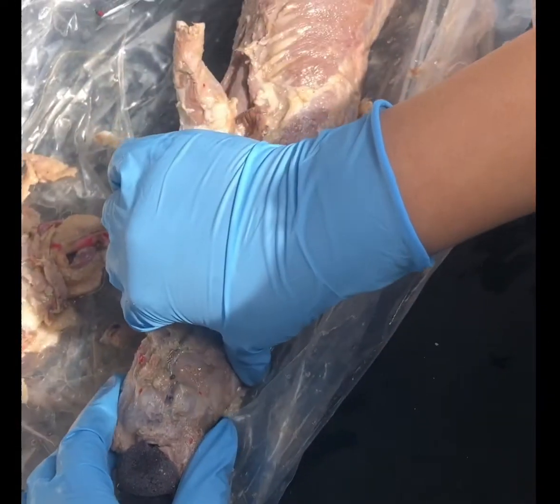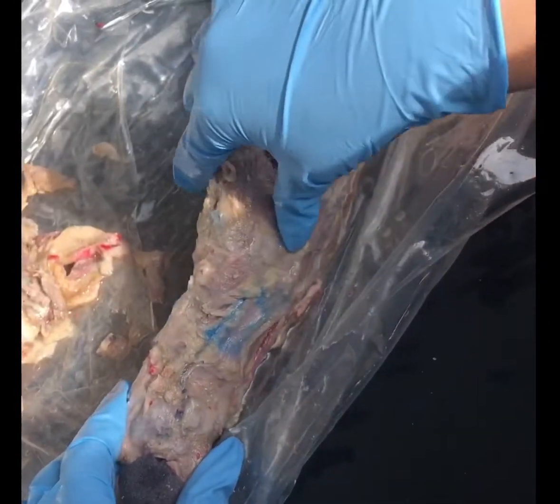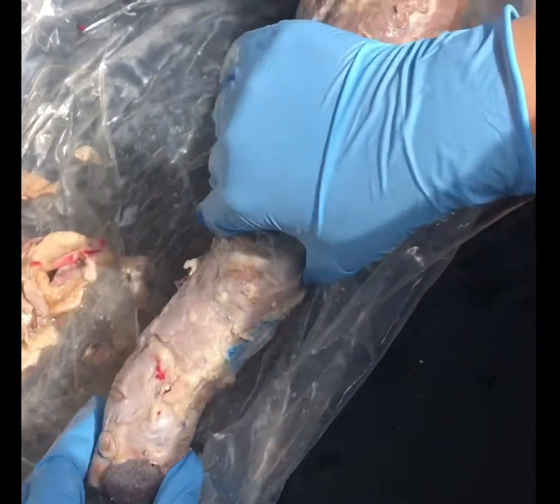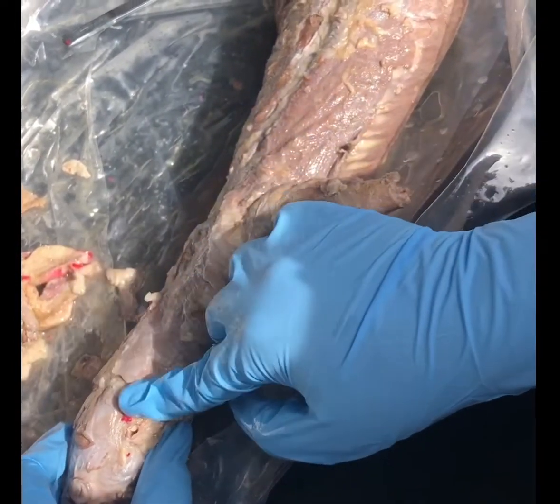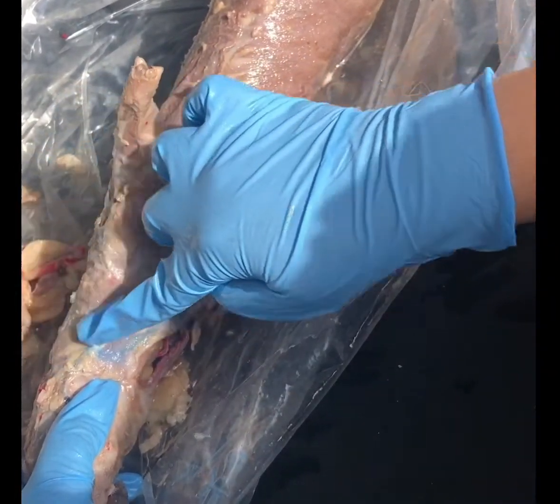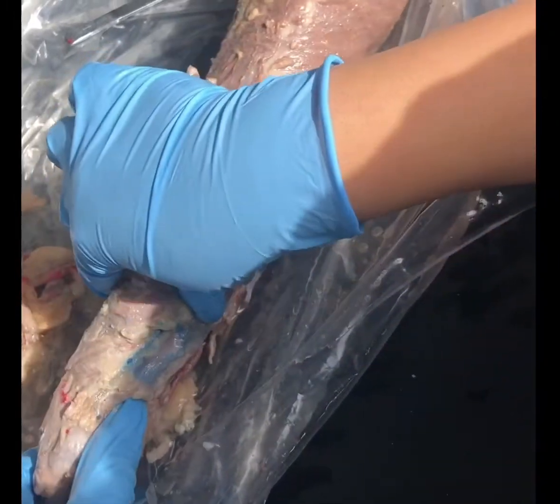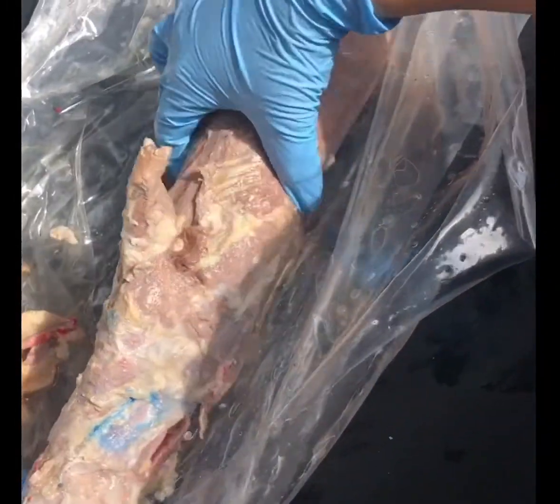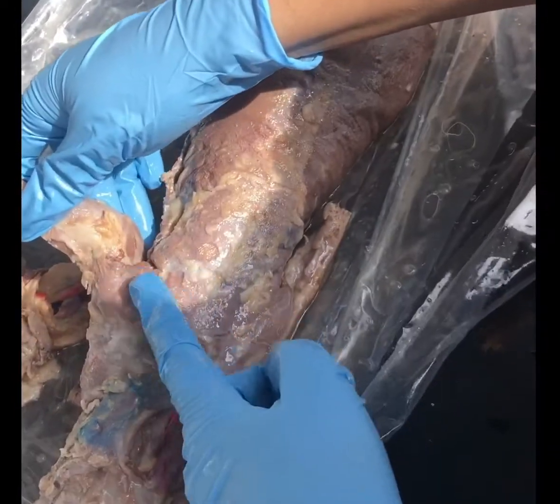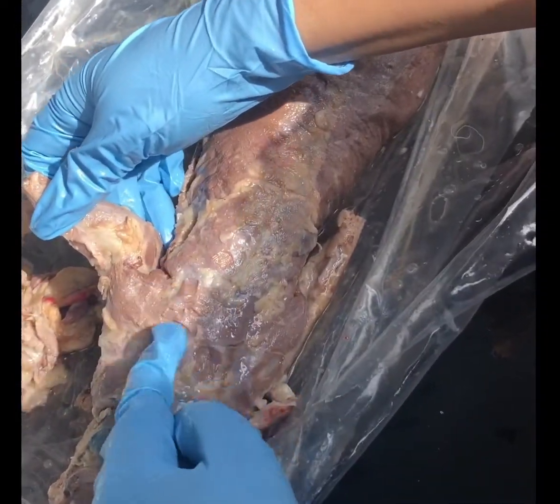And then the sternocleidomastoid is the muscle that rotates the head. So in humans, it goes from the neck all the way down to the sternum, kind of. The pectoralis major, it's gonna be right here. This is the pectoralis major right here.